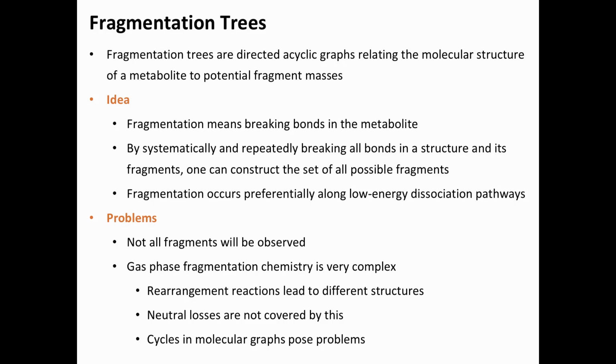Now, of course, not all bonds in the structure would be broken. All bonds are not equal. They have different bond strengths. Some bonds are more likely to break than others. And it's not easy to predict that. When you try to do that, you end up very quickly with doing quantum chemistry. And that is something that doesn't scale very well. Having started out as a quantum chemist at some point, I can attest to that.